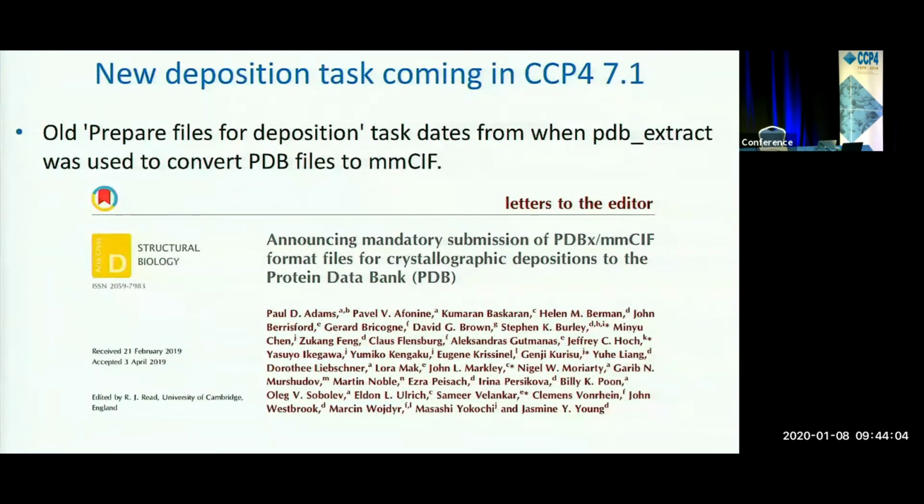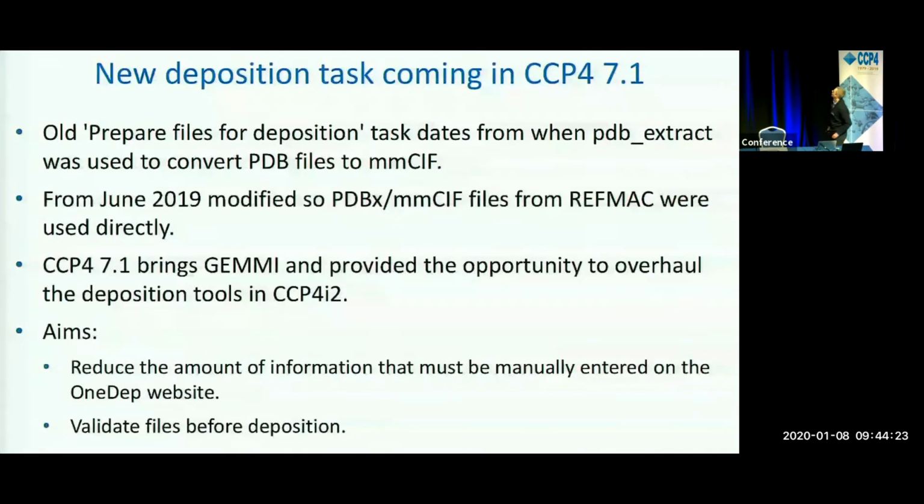But as hopefully everybody here knows, from the beginning of July, the PDB decided that it was mandatory that coordinates from crystallography were deposited in PDBx/mmCIF format. And so from the end of June, our CCP4i2 deposition task was modified so that the PDBx/mmCIF files written by REFMAC would be used directly.